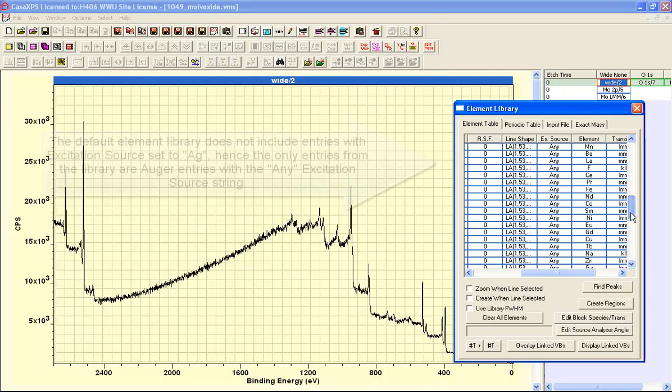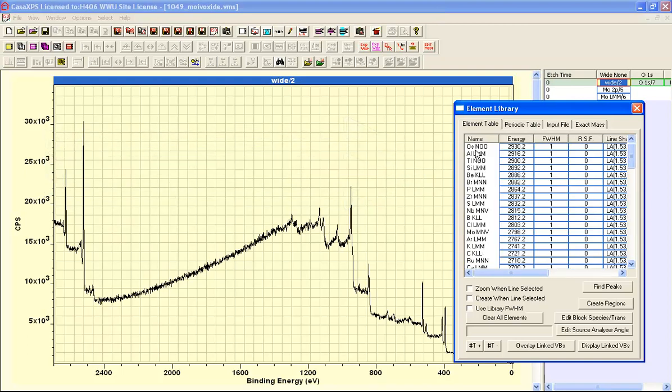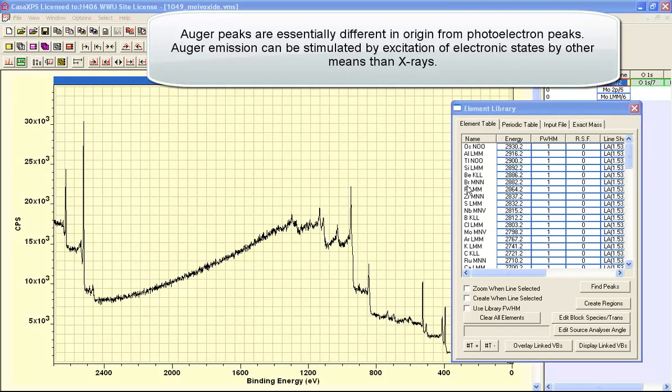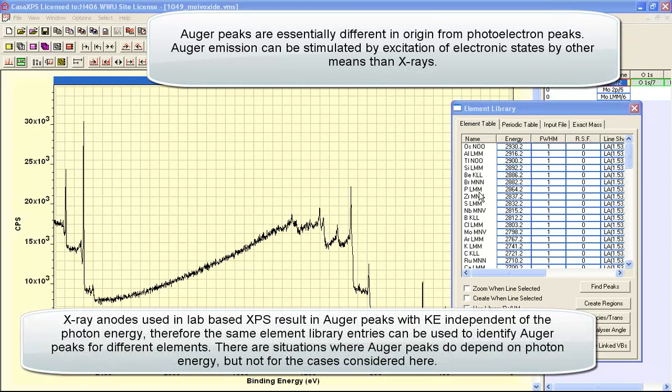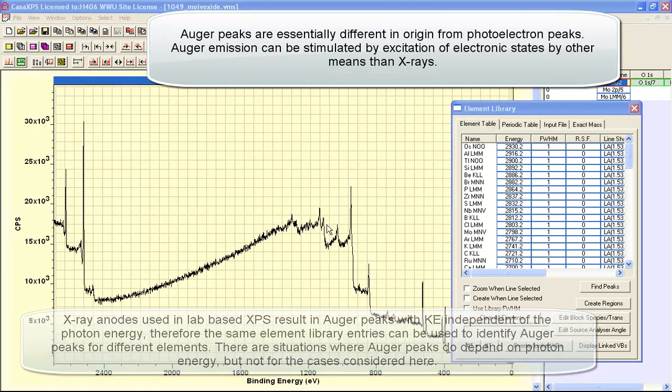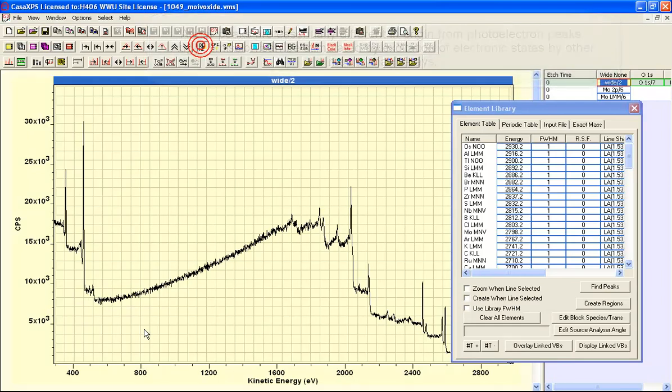This library does not have any photoemission lines with the silver source label so the only transitions listed in this table corresponding to these data are Auger transitions. The reason the element library can still display Auger transitions even though the element library is set up for aluminium and magnesium is because these Auger transitions are independent of the photon energy. Although these data were collected using a silver anode, the Auger lines such as this oxygen sequence here are common in terms of kinetic energy to all X-ray sources.